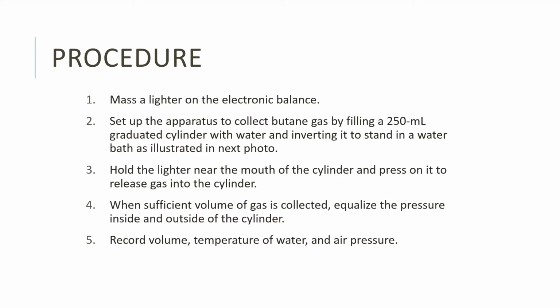When a sufficient volume of gas is collected, equalize the pressure inside and outside of the cylinder. Record the volume, temperature of water, and air pressure. Lastly, dry the lighter thoroughly and mass it again.